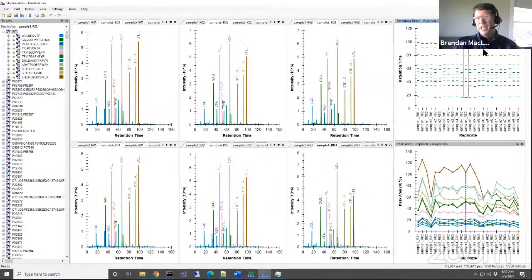And then, but really, I probably expect to see some variance, but I pretty much hope that they're going to stay very similar. These little bars here represent the width of the peak, so you get some sense of the width of the peak as if you're looking down on it.